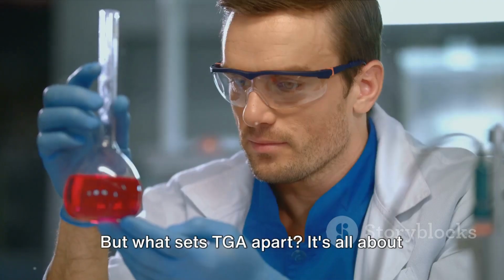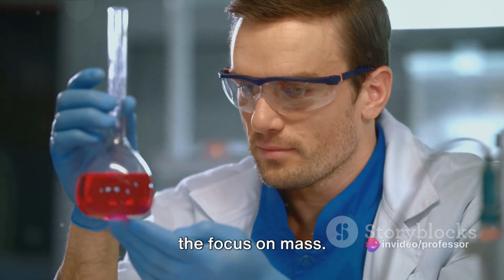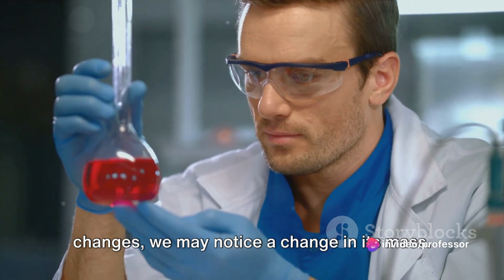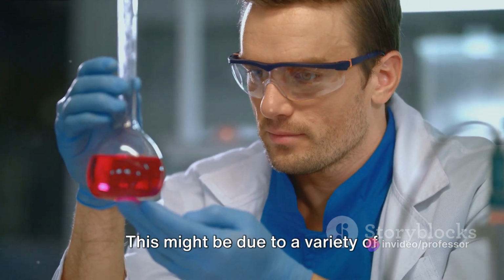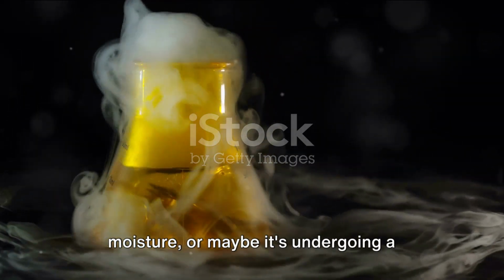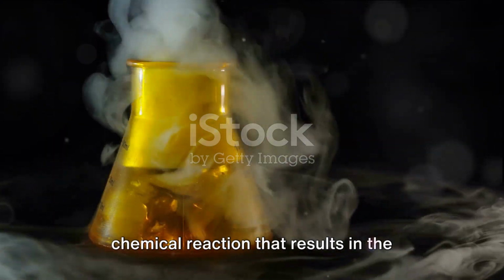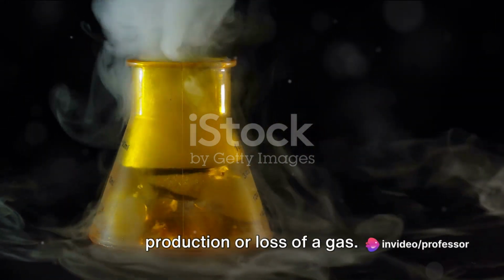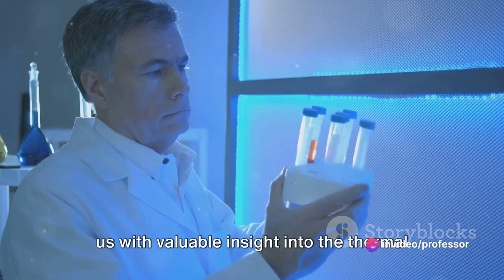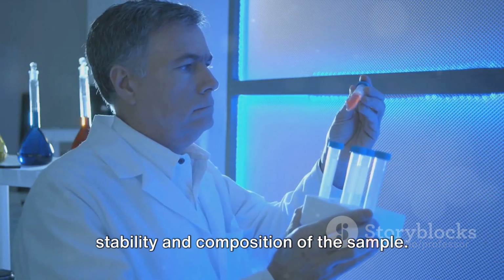But what sets TGA apart? It's all about the focus on mass. You see, as the temperature of a sample changes, we may notice a change in its mass. This might be due to a variety of reasons. Perhaps the material is losing moisture, or maybe it's undergoing a chemical reaction that results in the production or loss of a gas. By tracking these changes, TGA provides us with valuable insight into the thermal stability and composition of the sample.